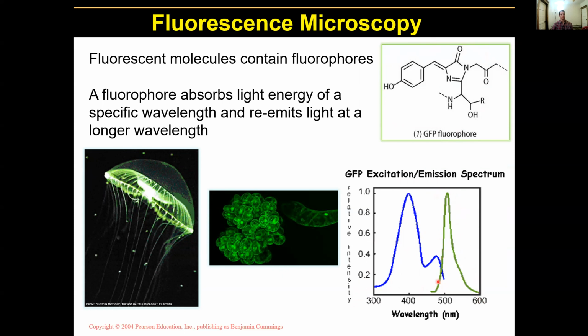This is what the fluorophore then pushes back out. That's not the right word. Re-emits, sorry, that's the word. So that's what it re-emits at a longer wavelength. Specifically, you look at the change in wavelength, where it's the short wavelength that comes in and the long wavelength that goes out. So very popularly, you can see the green structures here. Green fluorescent protein is a very popular way to visualize structures.